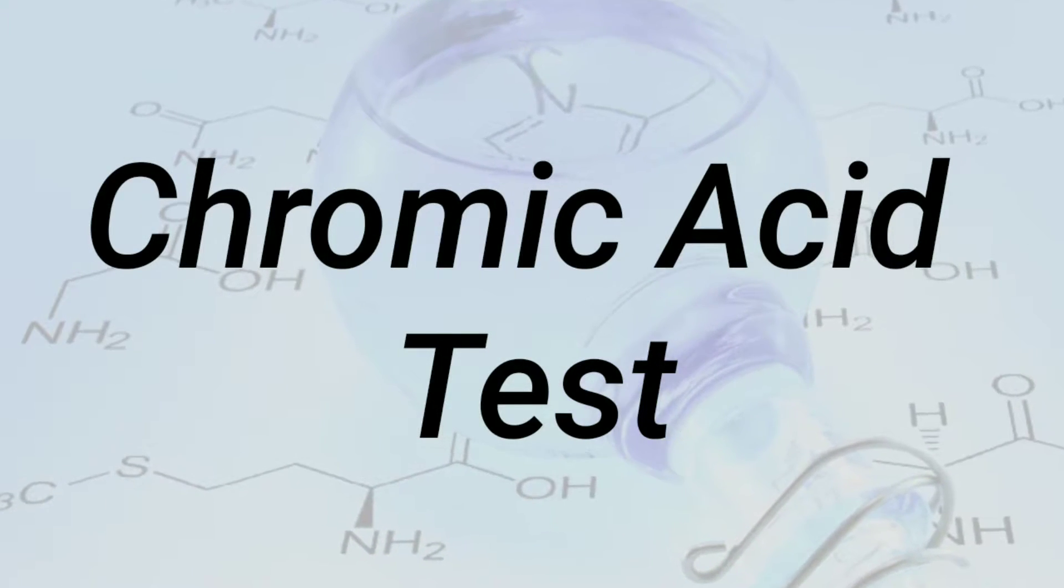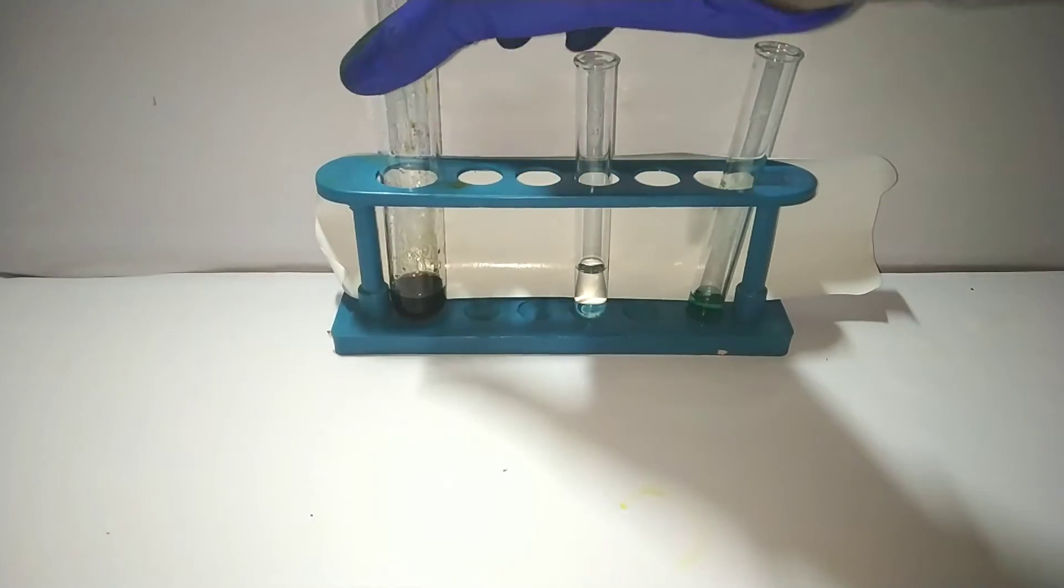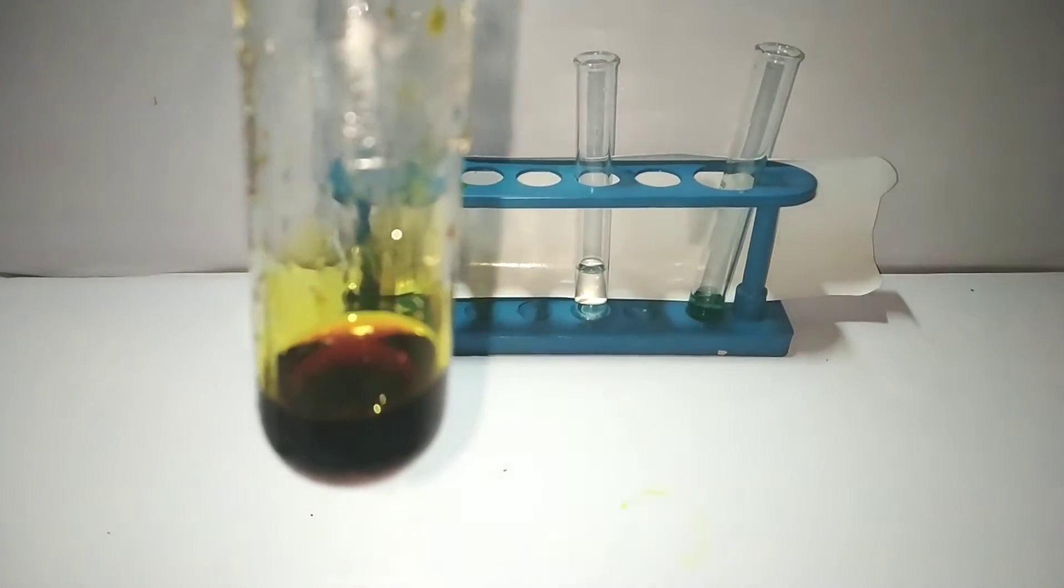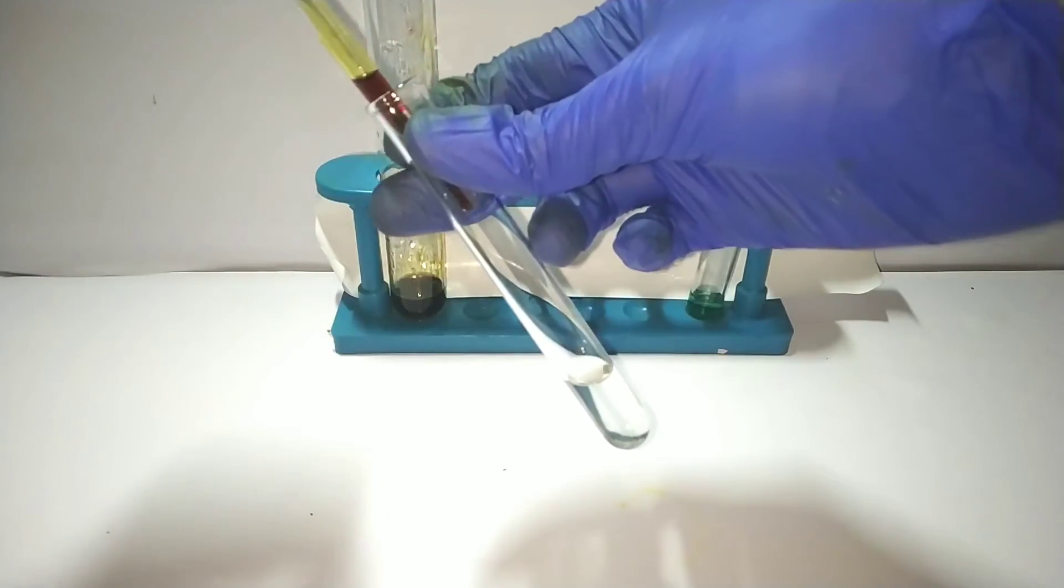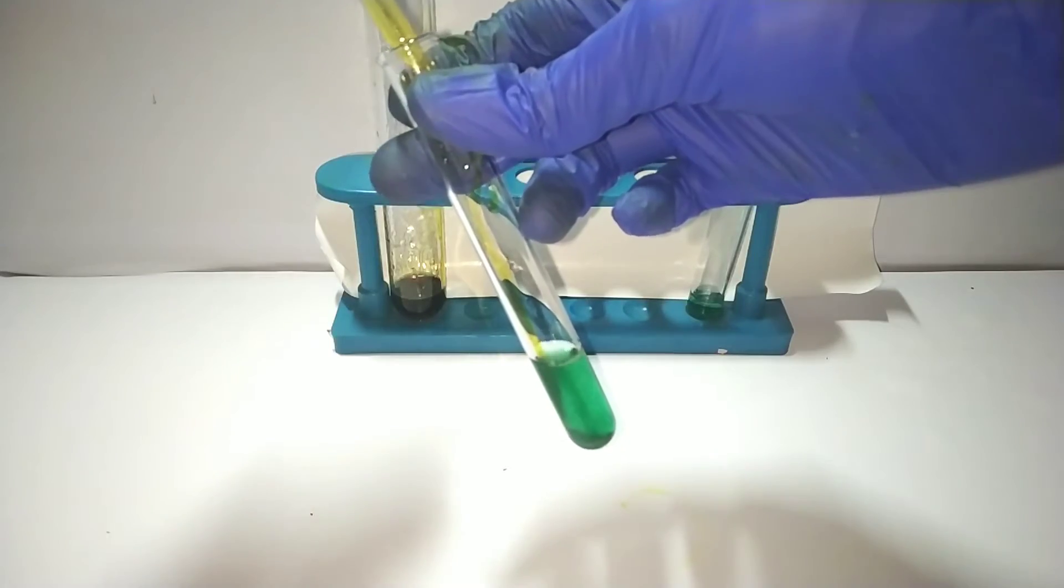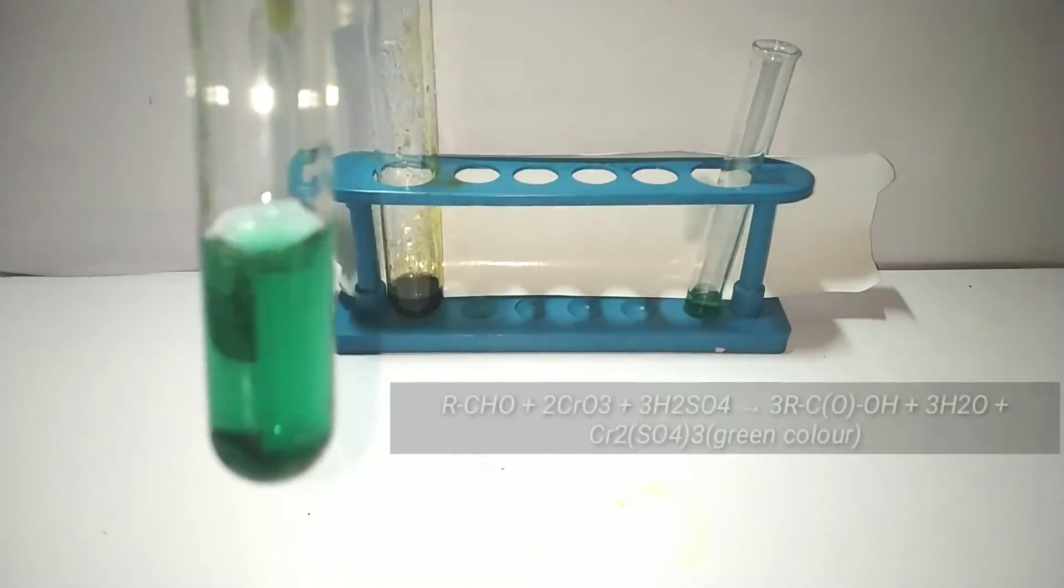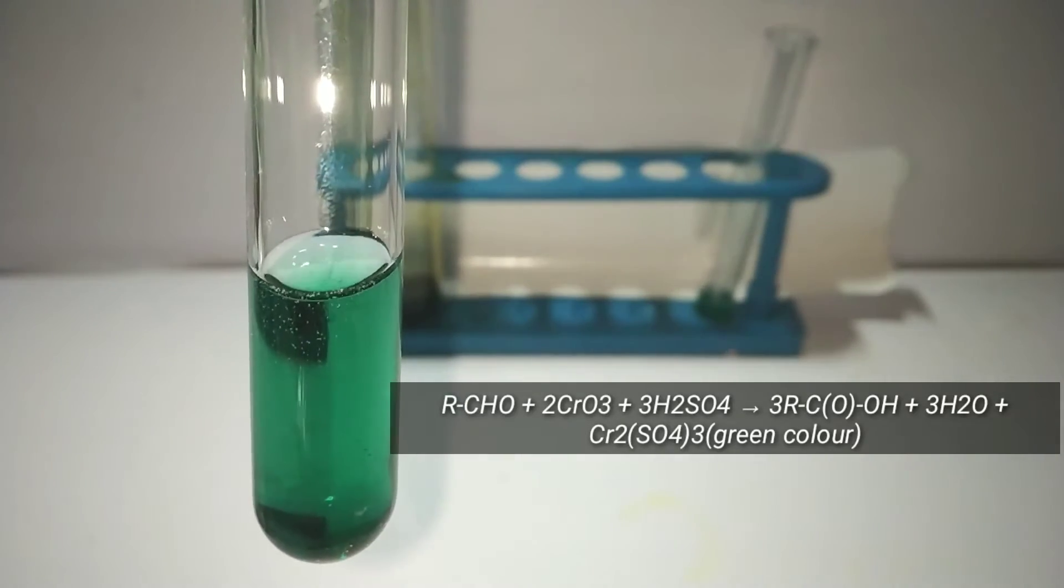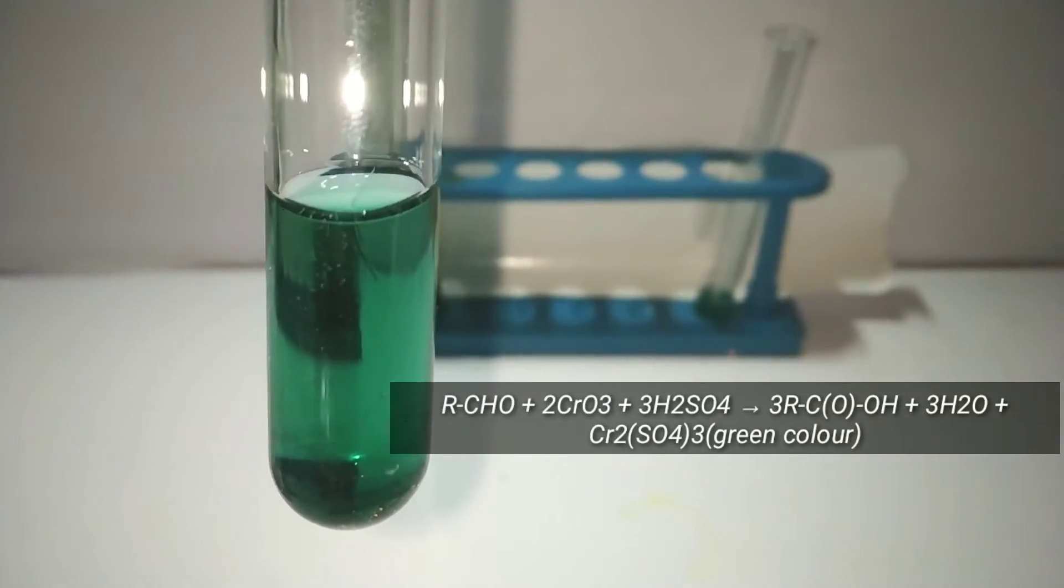Chromic acid test. This is another test specific to aldehydes. Chromic acid reagent was prepared by adding about 2 ml of concentrated sulfuric acid to 0.5 g of potassium dichromate. The resultant solution will be deep red in color. Now let us do the test. A few amount of chromic acid reagent was taken with a glass dropper and was transferred to a test tube containing the organic compound. Appearance of a green color is observed. What's happening here is chromic acid, being a powerful oxidizing agent, oxidizes the aldehyde to the carboxylic acid and in turn reduces to chromium 3 plus, which reacts with the sulfate ion to form chromium 3 sulfate, which is the green color.